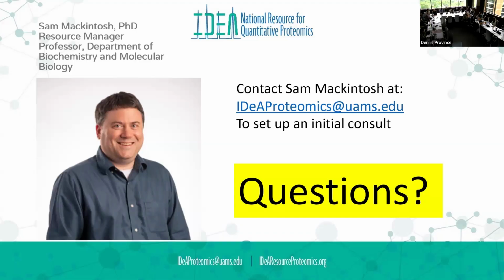Is the selection between DIA or TMT dependent on the research question, or can we start either way? It does. So I think what Rick would say if he were here is, if you're just starting off and you have this paper and you say, hey, I want to do TMT, we would talk you out of it, unless there was a specific reason.